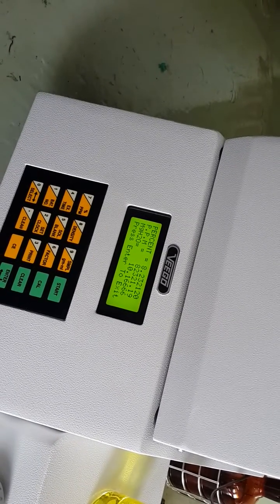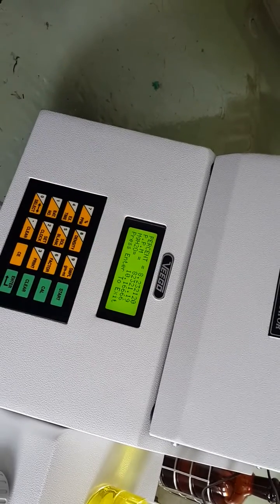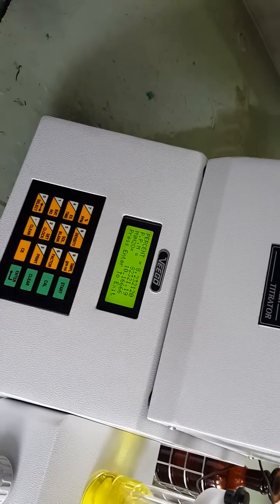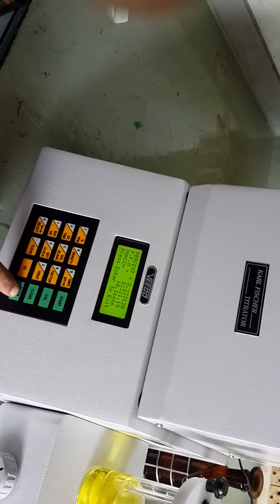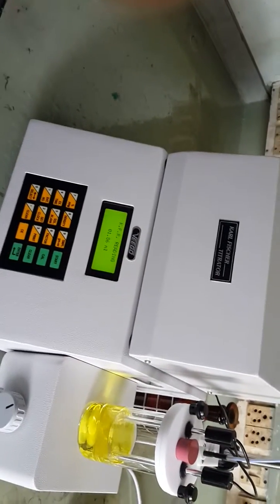The result shows 8.23% water, 82,321 ppm, and 10.166 milligrams of water was titrated — this gives the complete result. Press enter once again and the titrator is ready to analyze the next sample.